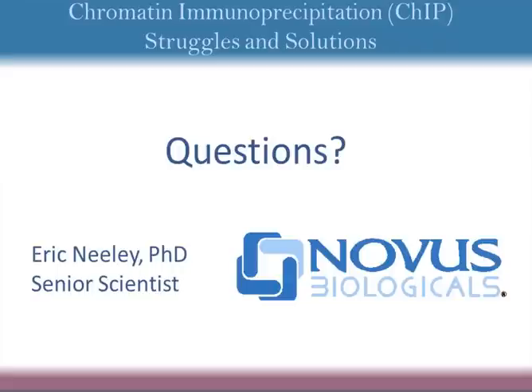So if you don't have a good smear, you don't have good fragmenting, stop right there. Don't continue on to the rest of the protocol. But we have a lot of examples, so calling our tech support can also help you as a shortcut to getting where you need to go.